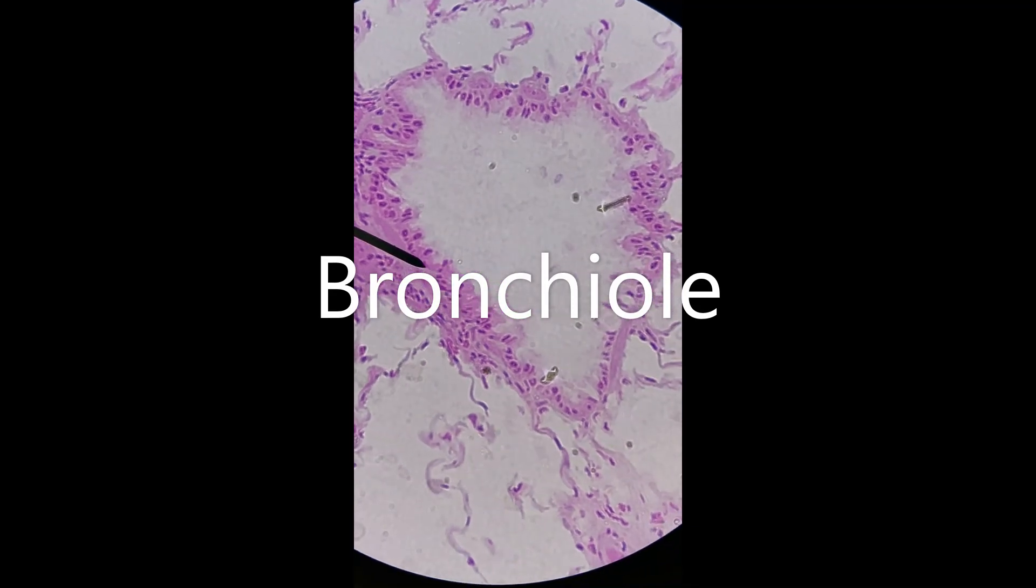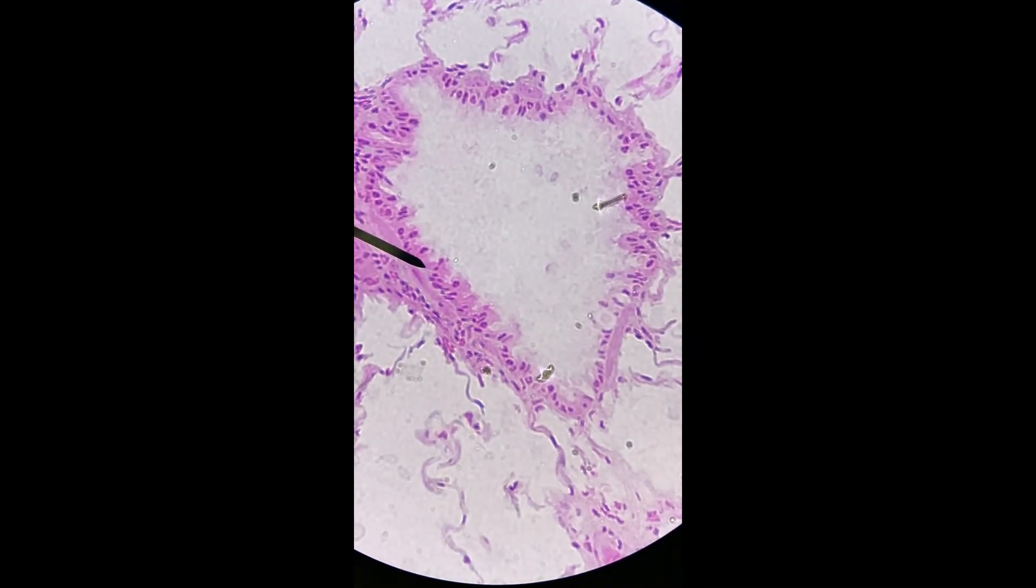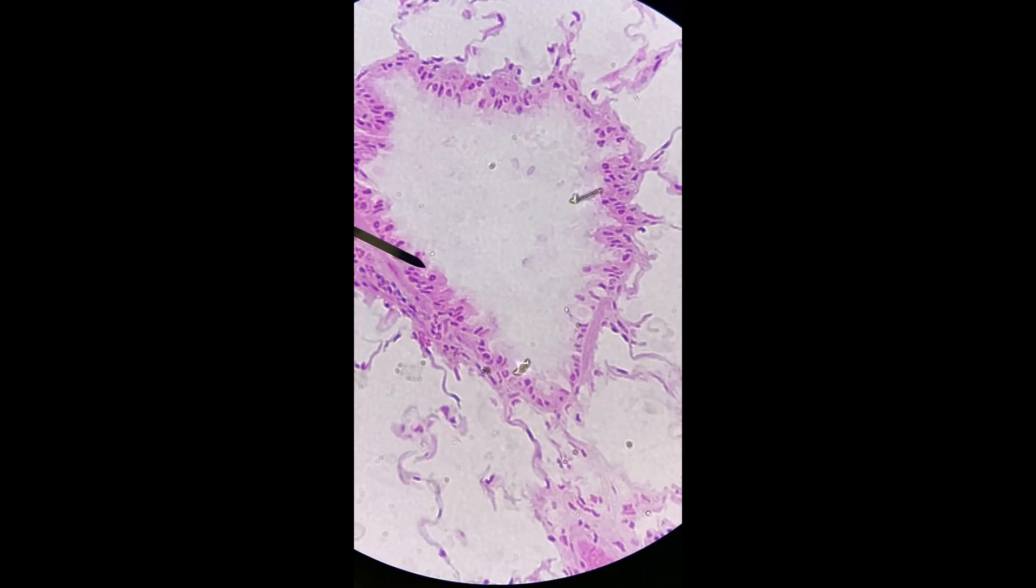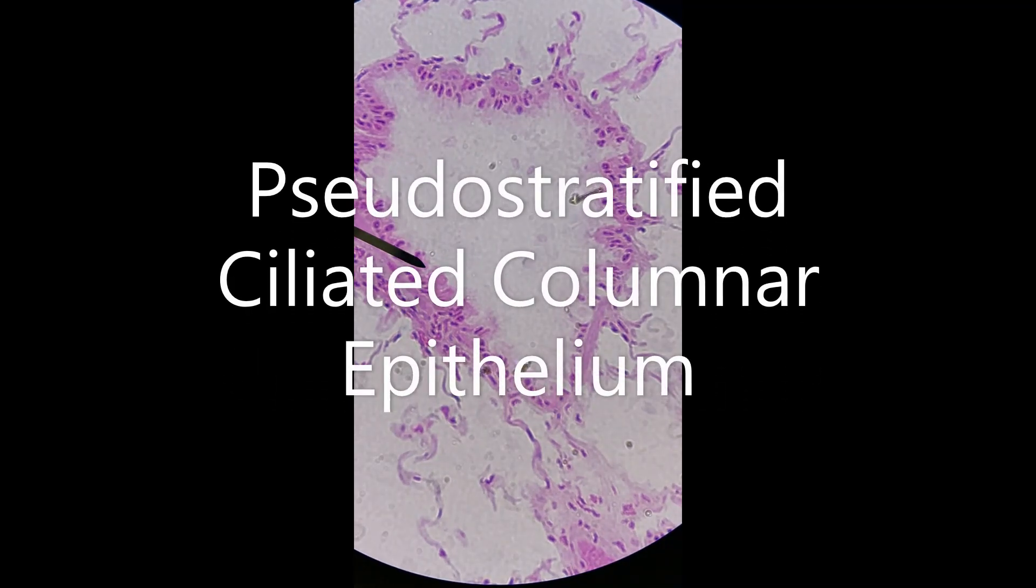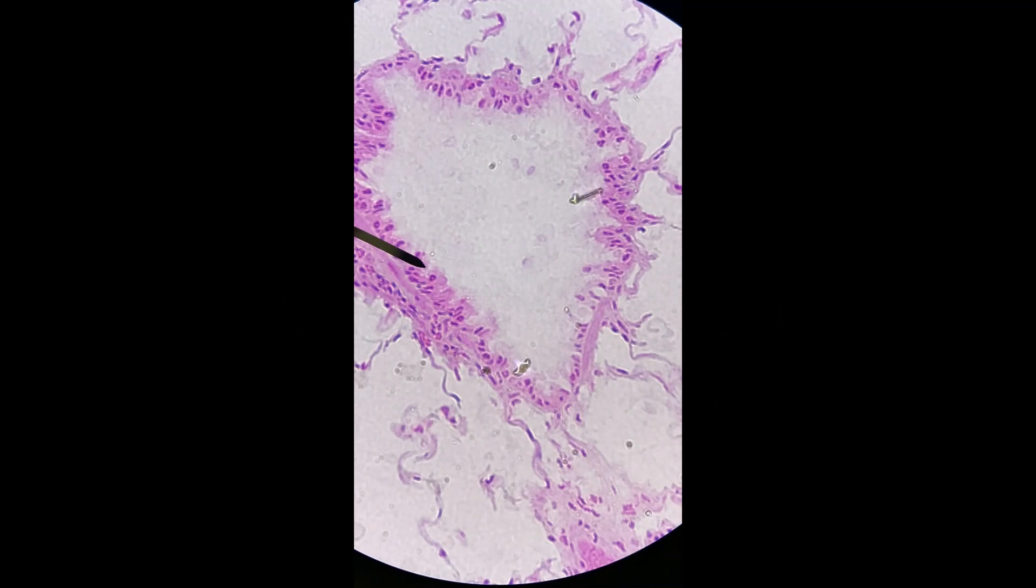That tissue on the inside that lines it, where the pointer is now, isn't a really awesome representation of it. But this is pseudostratified ciliated columnar epithelium, just like you'd have in your trachea.